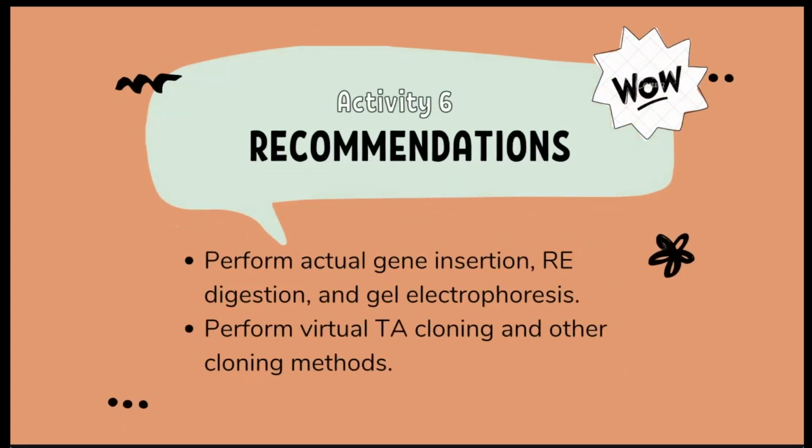Now here's our recommendation. First will be to perform actual gene insertion, RE digestion, and gel electrophoresis in lab. And second will be to perform virtual TA cloning and other cloning methods.